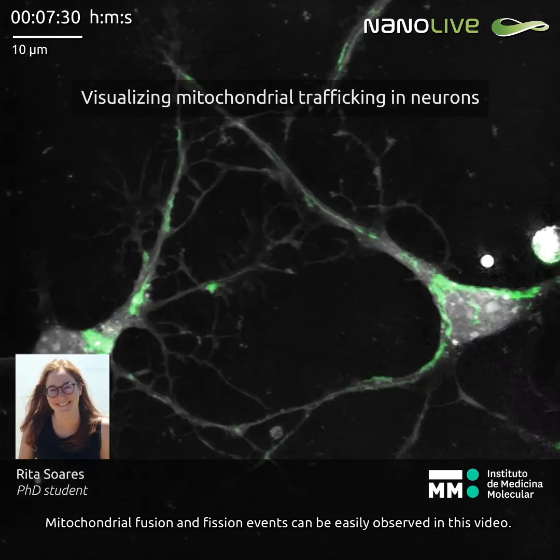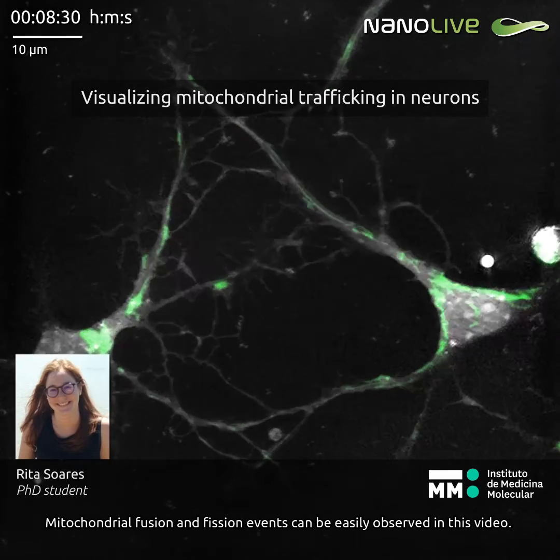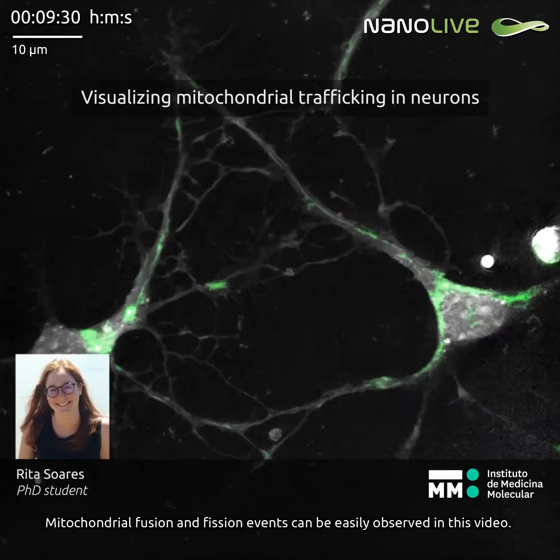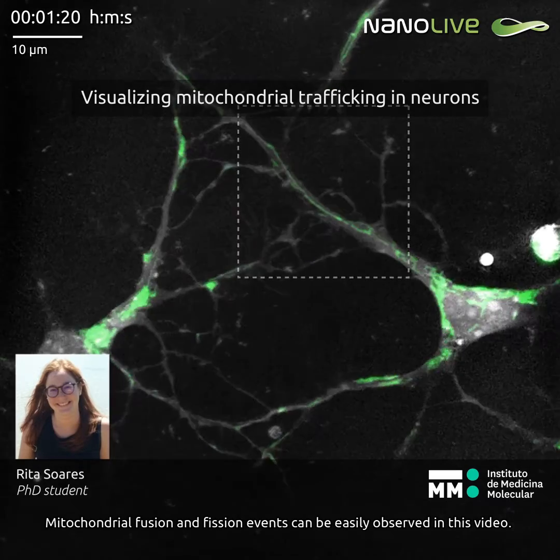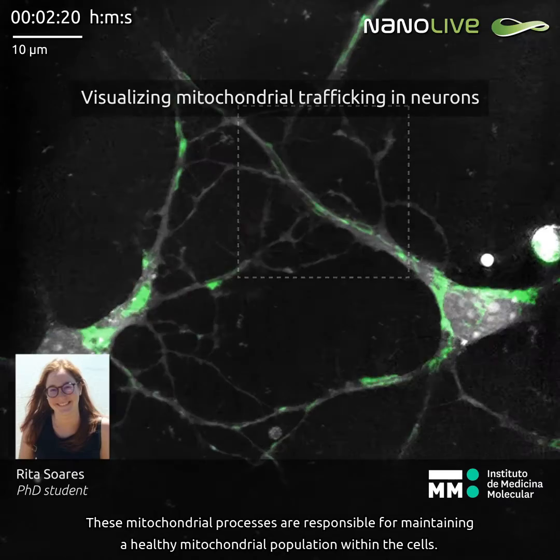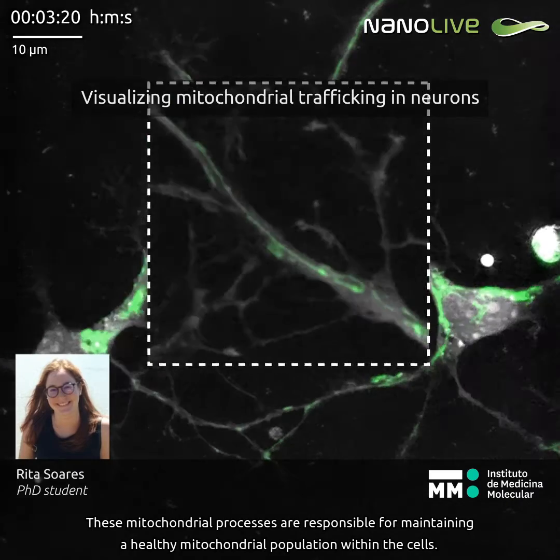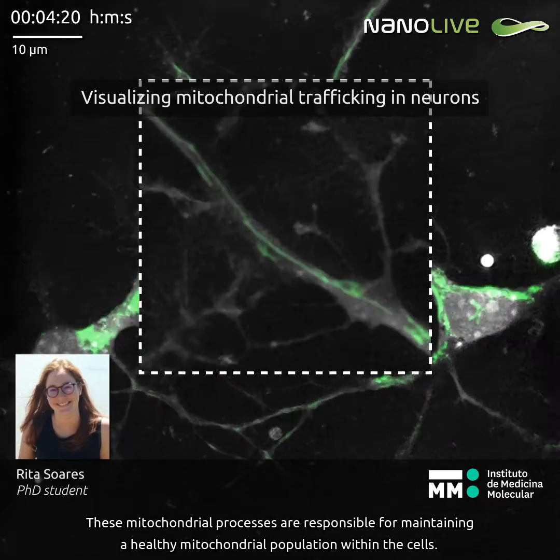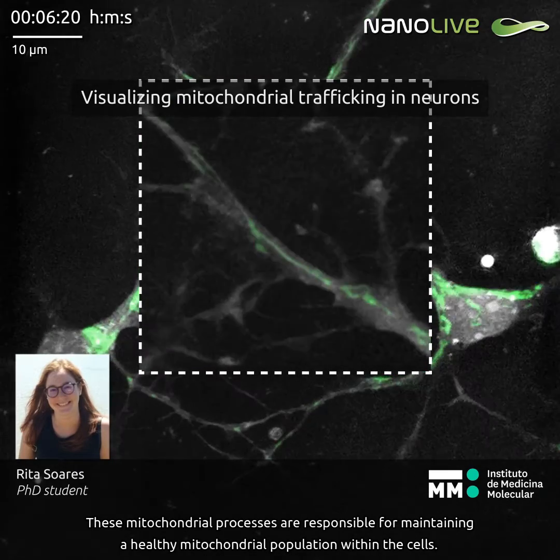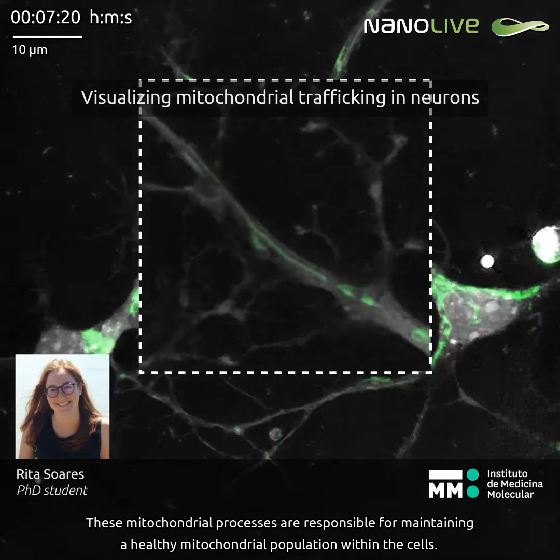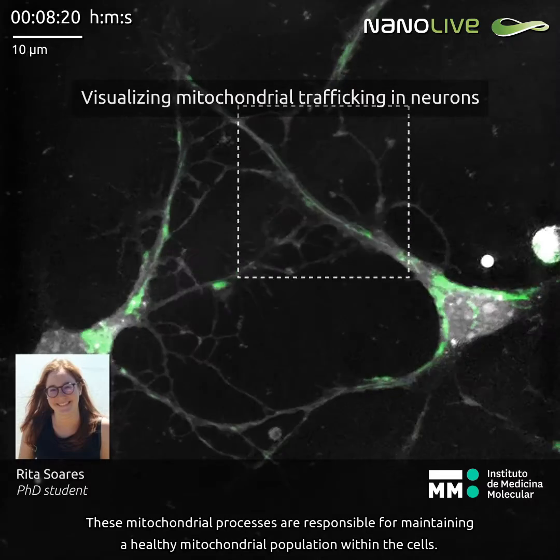Mitochondrial fusion and fission events can be easily observed in this video. These mitochondrial processes are responsible for maintaining a healthy mitochondrial population within the cells.